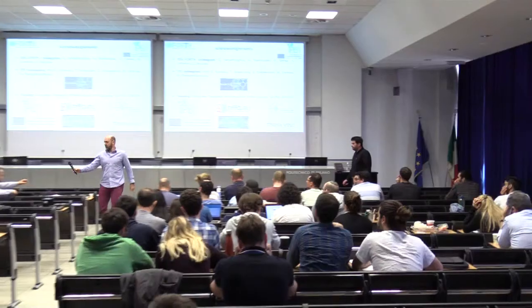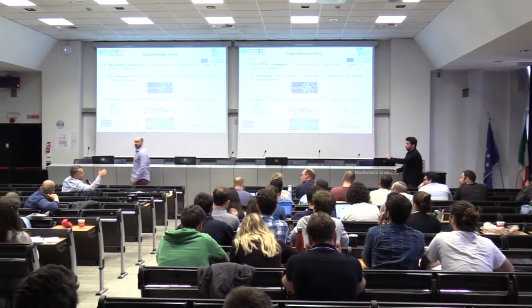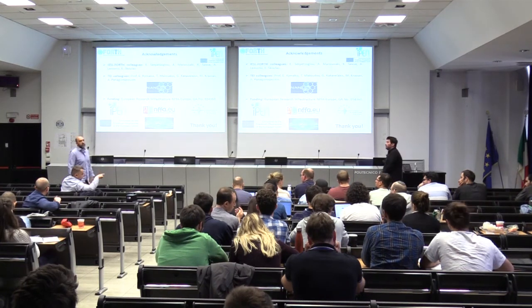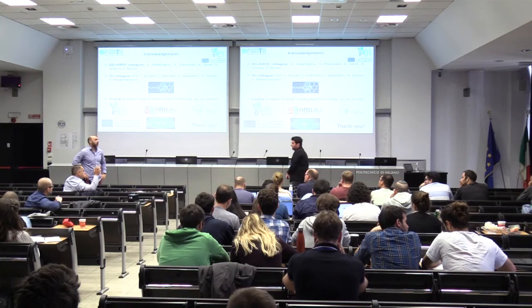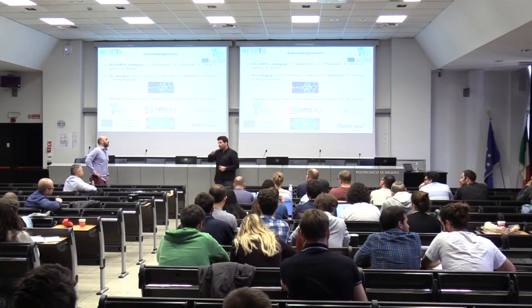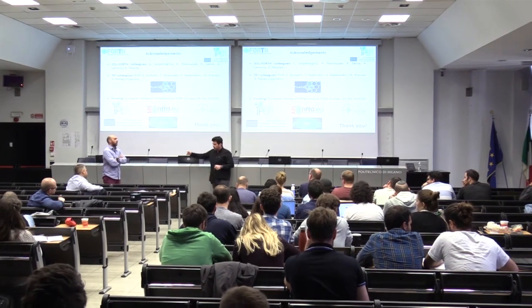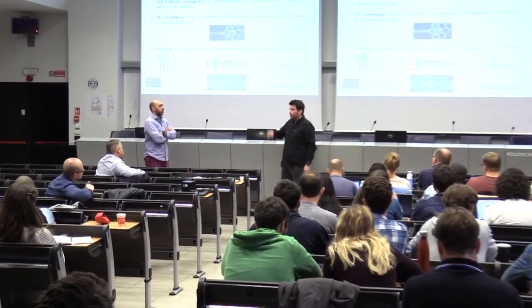Yeah. That's why I said that we just follow the literature. I saw some data there, but it goes up to 1,000 picoseconds, I think. Yes. But then in the exponential time, you show 10 to 6. Yes, this is the weakness of this. We know people do an extrapolation, and they believe they have enough to see how this will extrapolate with time. I totally agree with you, but we were forced by a reviewer to do it.